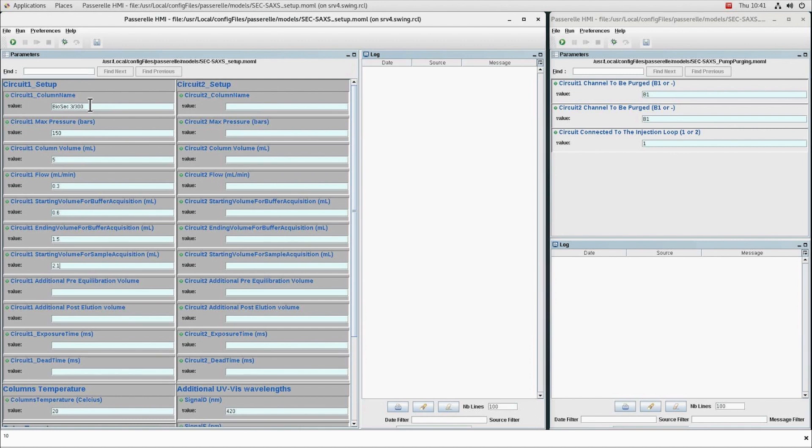The elution volume which will define the start of the sample acquisition. After aggregates have eluted, the sample acquisition will stop when the total volume of the column is eluted.